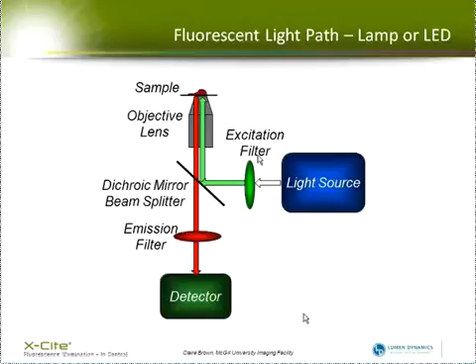So a general schematic here showing the light microscope in an inverted architecture is you have your light source, which typically gives off white light. And then you have an excitation filter, which chooses the color of excitation light. So here, this is a green filter, choosing green light from the light source. That then reflects off a dichroic mirror. This is a mirror that reflects certain wavelengths and passes other wavelengths. So this mirror in this example is reflecting the green light up onto your sample.